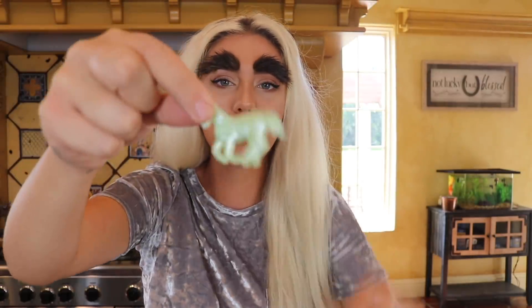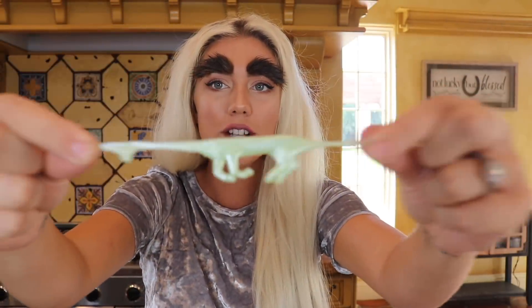Last but not least, we are going to be checking out this stretchy gummy horse. Here's the horse — looks interesting, very shiny, very gleamy. Here's the tail of the horse. Nothing much to report here, just really cool. Give this video a big thumbs up if you enjoyed this. Maybe I can make a series of looking at things under a microscope — I think that'd be really fun.